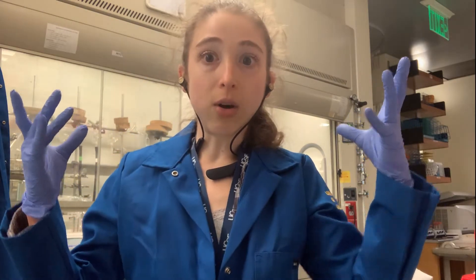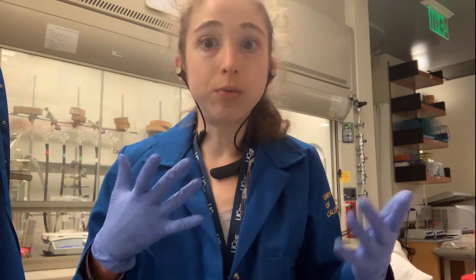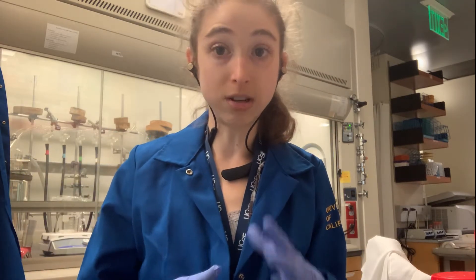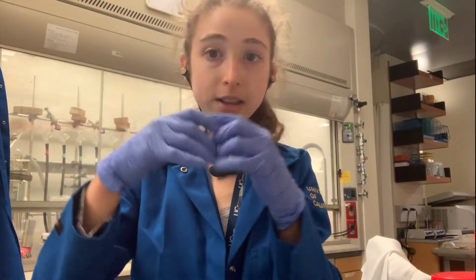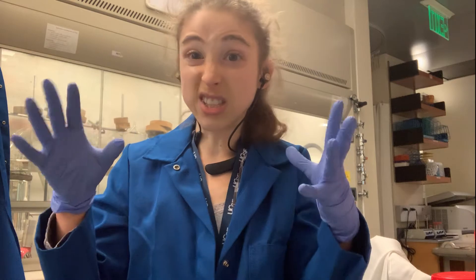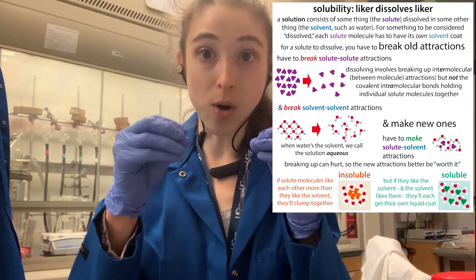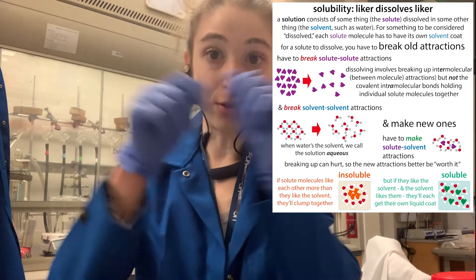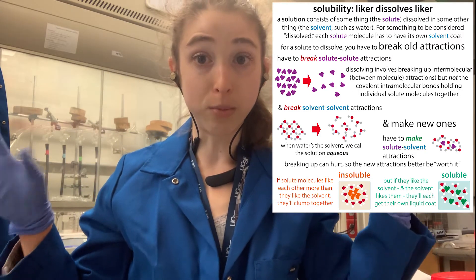When weighing out solids, it's hard enough to get things to dissolve when they're in powdery form — but if they're a big clump, it's really not good. You want to prevent clumps from forming in the first place, which is why you should always close the bottles really tightly. Don't leave the bottles open while you walk over to your bench to do calculations. Water molecules from the air will get in and make things clumpy. When things clump, they're very hard to dissolve because every little molecule needs to get a coat of water, and a big clump gives the water far fewer opportunities to interact with the solid.